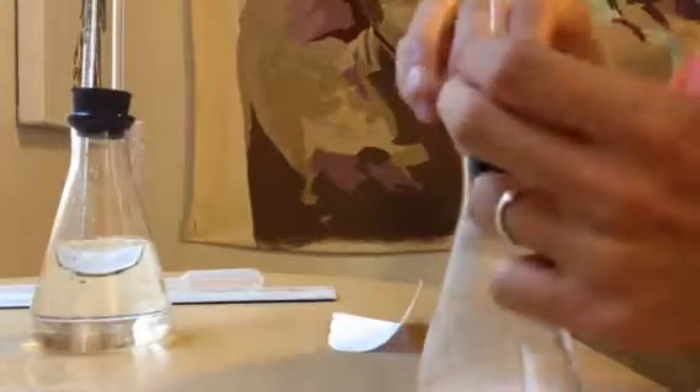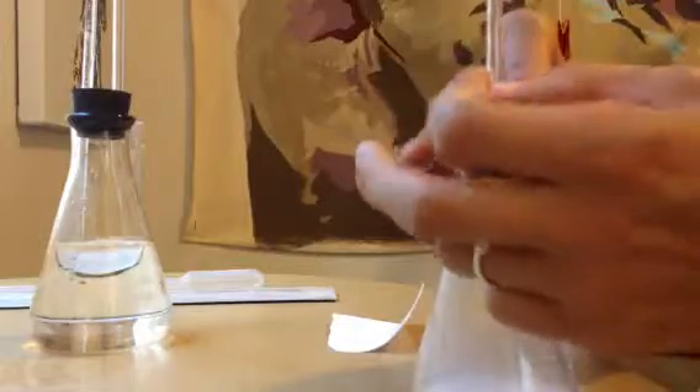I'm holding it on tight so it's not going to escape. You can see it's a vigorous reaction — it's going crazy. And here's all sorts of water getting pushed up over here. That's pretty cool.